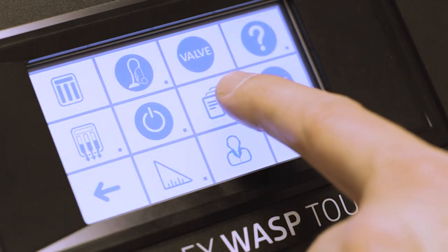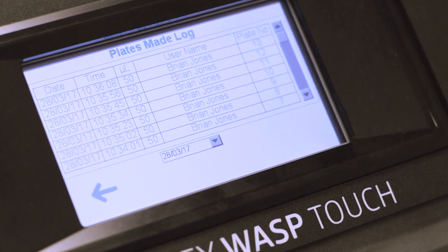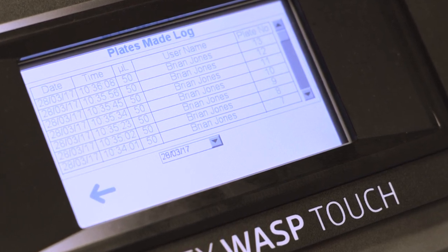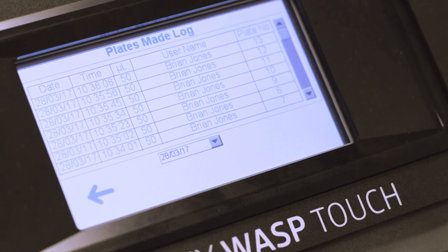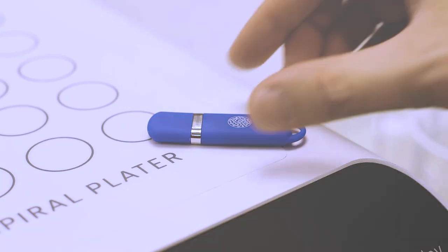For each plate, the touchscreen software records parameters including plate identification, dispensed volume, user name and the date and time of plate preparation. All records are PIN code protected and can be downloaded via USB.